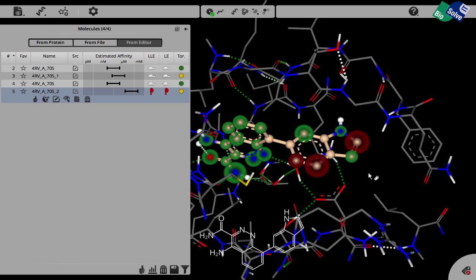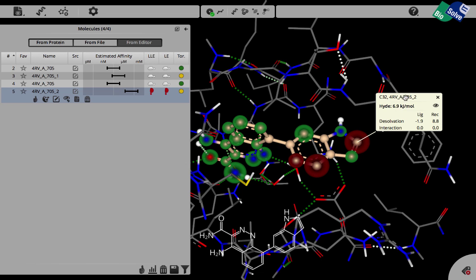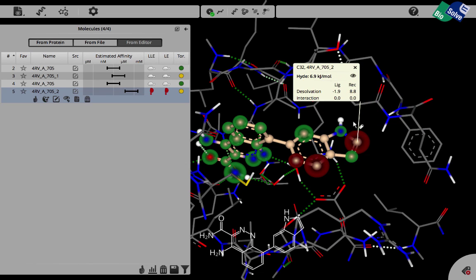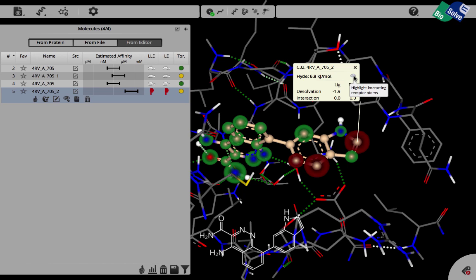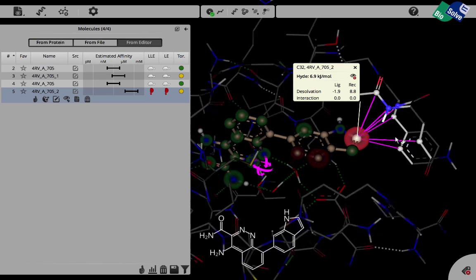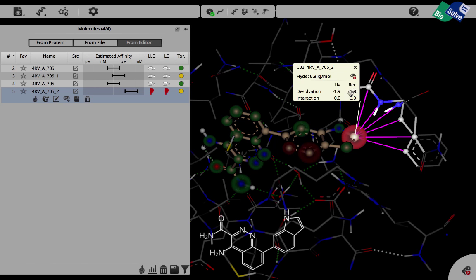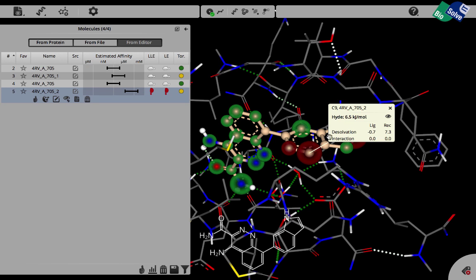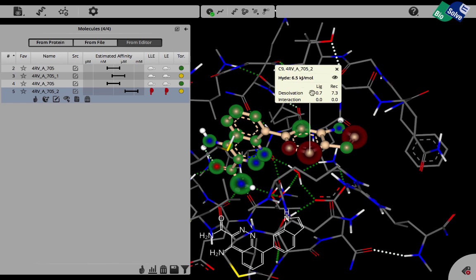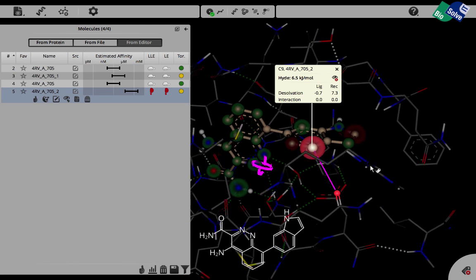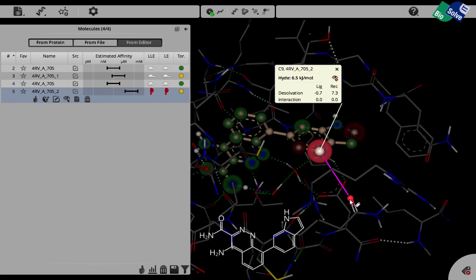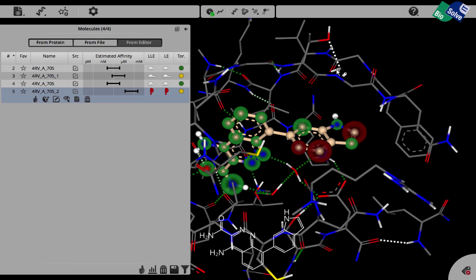We can start to analyze. We make a label on this carbon and we can see that there's almost 7 kilojoules penalty which comes from the receptor only. And we can visualize this by clicking on the eye and we can see that it is these two nitrogen atoms here that are not involved in any hydrogen bond. And this is responsible for this penalty of 8.8 kilojoules per mole. Likewise, for this carbon here, there is a penalty of 7.3 which comes from this carbonyl oxygen here. It's not involved in a hydrogen bond and therefore has to pay a dehydration penalty of 7.3.